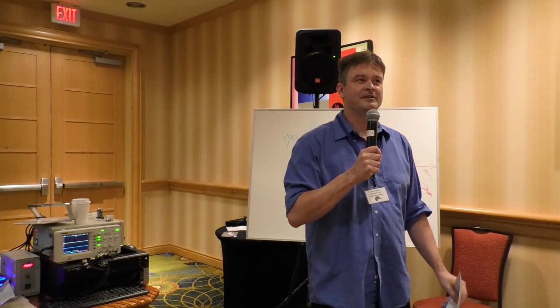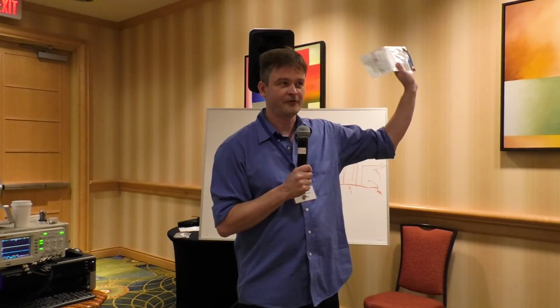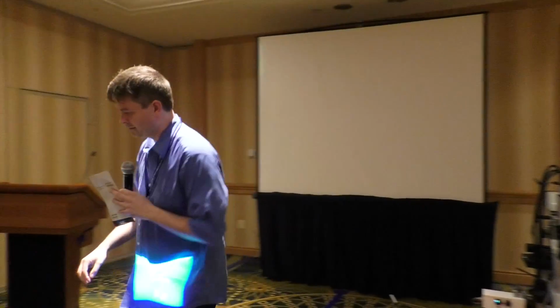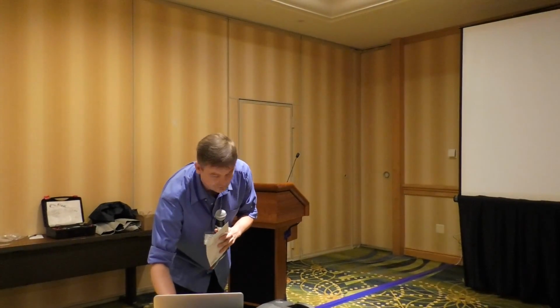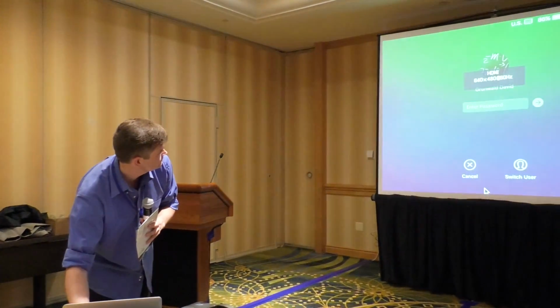No. Sorry. This is for the people in the room who feel like, oh God, I don't really trust my microscope and I have no idea what that facility guy is talking about. Focal check beads. Yeah, they are a very beautiful thing in cases like this. Just let me show you. Come here.